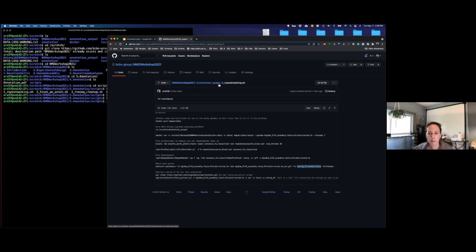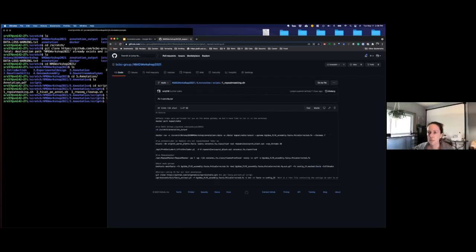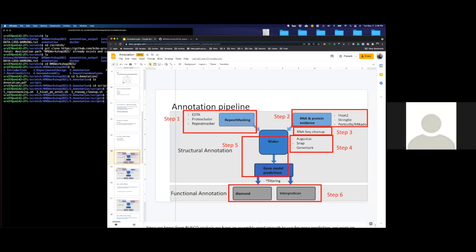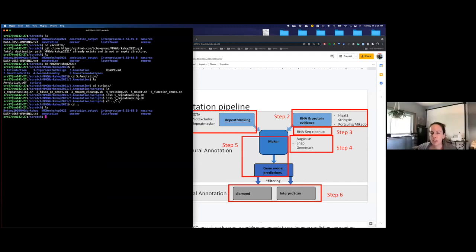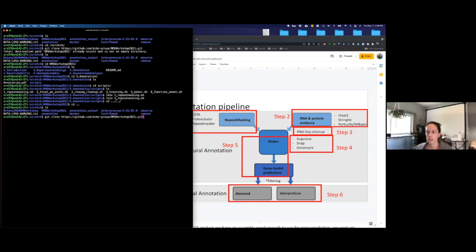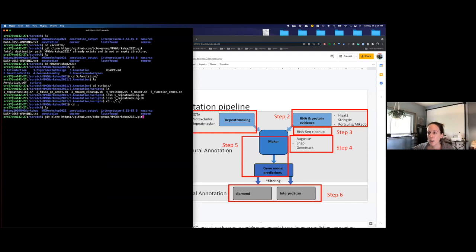Where have you got this NMG Workshop 2021 folder from? Do you mean the git clone command? Yeah, was that supposed to work? Oh yeah, it should work for everyone. How long is it supposed to take? It shouldn't take more than a couple of minutes. Oh, it seemed to be saying it was going to take half an hour or something. Huh. Yeah, when I ran it earlier, it was pretty quick, just a couple of minutes. I would just let it run.